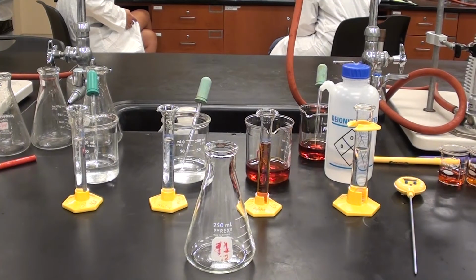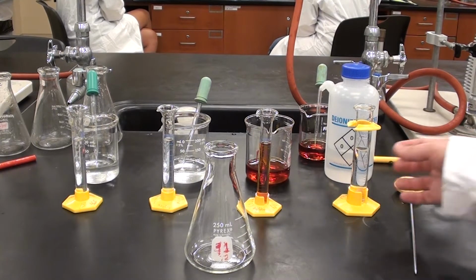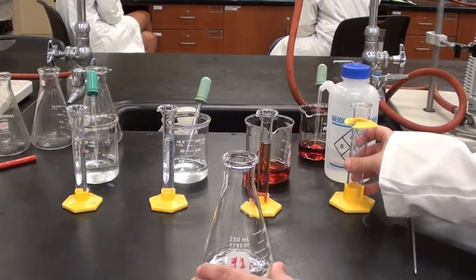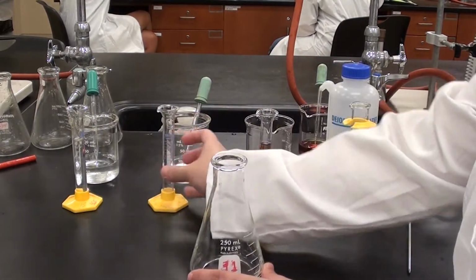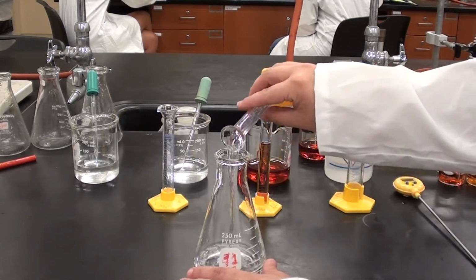So I'm doing one of the trials here, and we'll see how long it takes and how we time it out. So Taylor, would you please go ahead and add in the water and the HCl and the acetone. So that's water that's there, that's 20.0 mL. This is HCl, that's 10.0 mL of the solution. And that one there is 10.0 mL of the acetone solution.